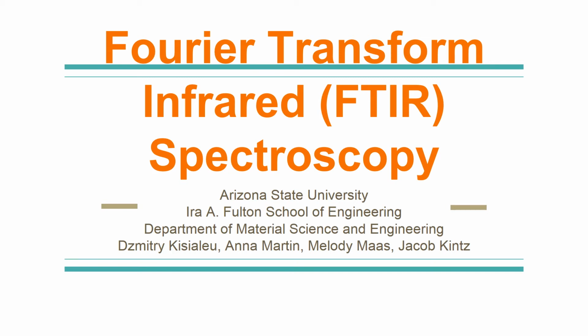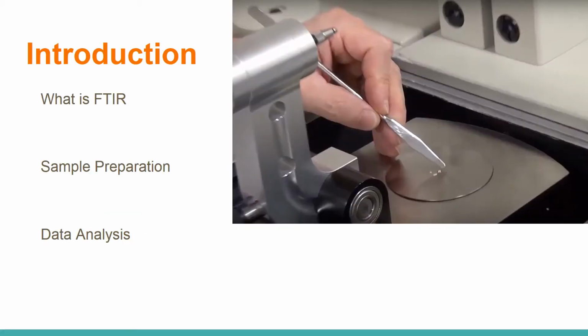Hey guys, today I just wanted to go through Fourier transform infrared spectroscopy and specifically walk through the machine located in the undergrounds in the Solid State Science department. So this is essentially all I'll be going over today, and I'll just quickly run through the concepts because this should already be pretty well known to the viewers out there, and honestly all the underlying concepts can be found simply by using a search engine.